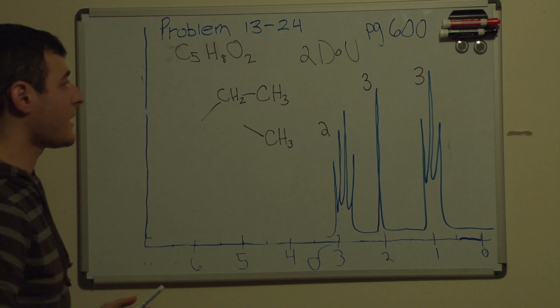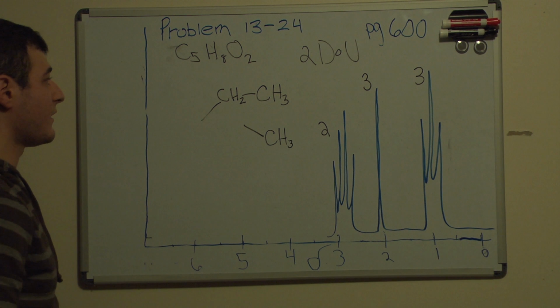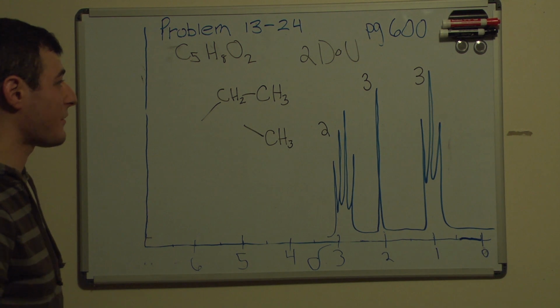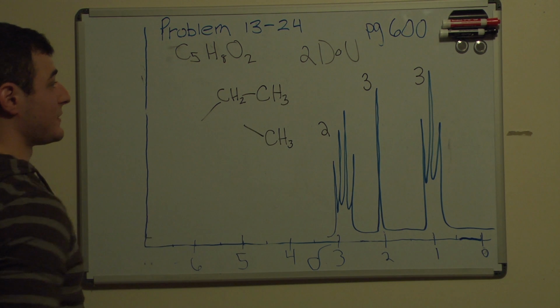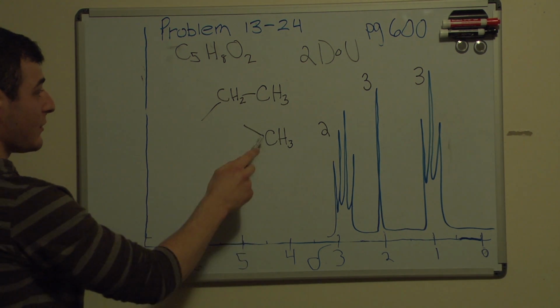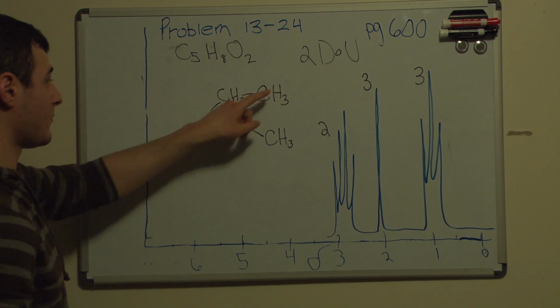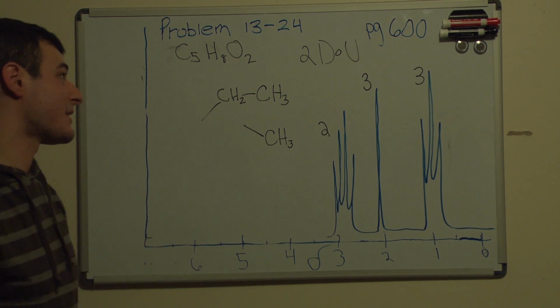So there's a couple things that could be going on with these oxygens here. I'm thinking a carbonyl. I guess you could have an ether, but I'm looking to knock out these oxygens and these 2 degrees of unsaturation. Plus, since we've only counted 3 carbons, there's 2 more carbons, yet 1, 2, 3, 4, 5, 6, 7, 8, no more hydrogens to use up.